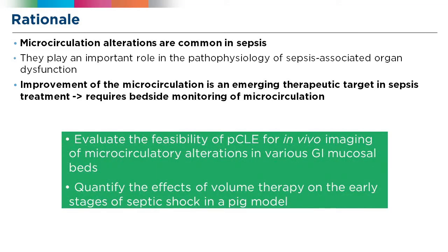So the objective of this study was to evaluate the feasibility of Cellvizio to image in vivo microcirculatory alterations in various GI mucosal beds, but also to quantify the effects of volume therapy on the early stages of the septic shock in a pig model.